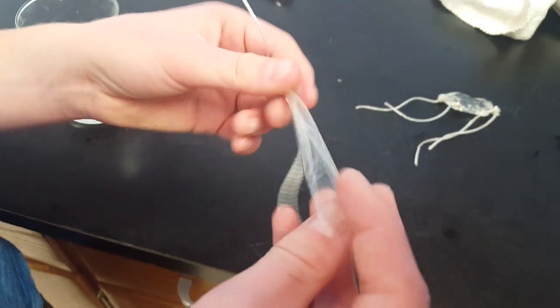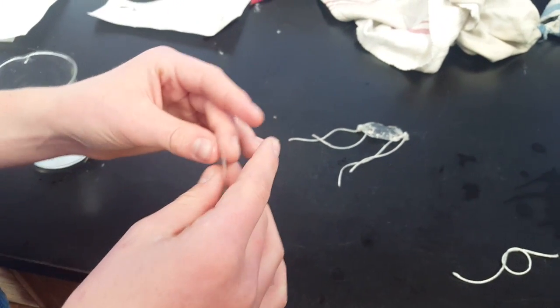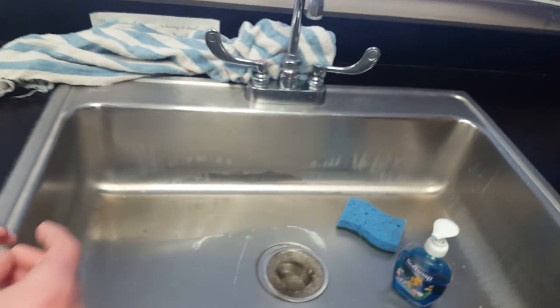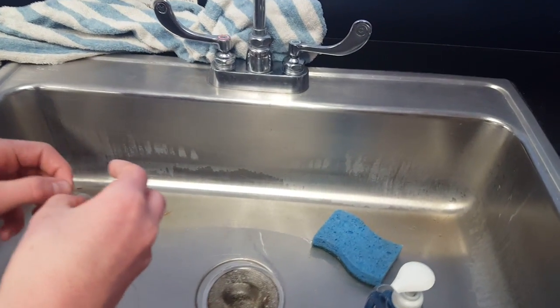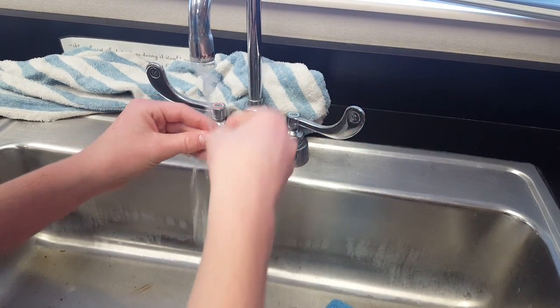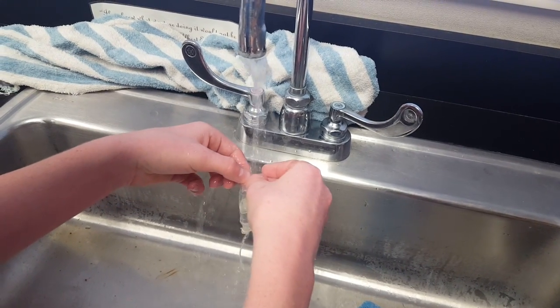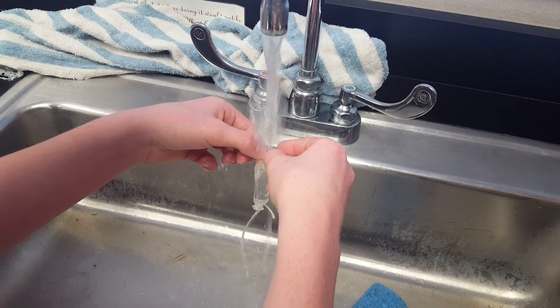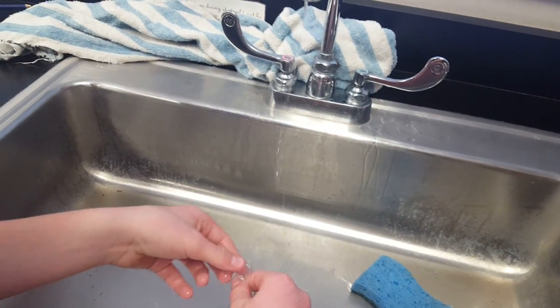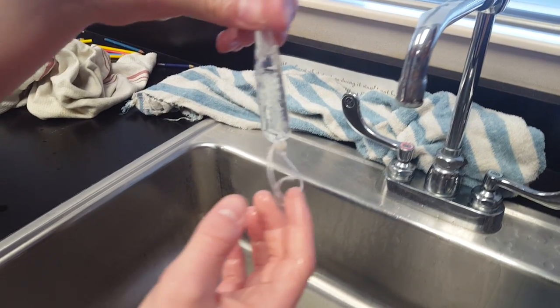Now that one end is sealed, student assistant number one is going to fill the dialysis tube up with water to make it into a cell-looking shape. He's going to come over to the sink and just add some water to that tube. You'll notice it quickly filled up. See how it's full of water now? Nice little tube.